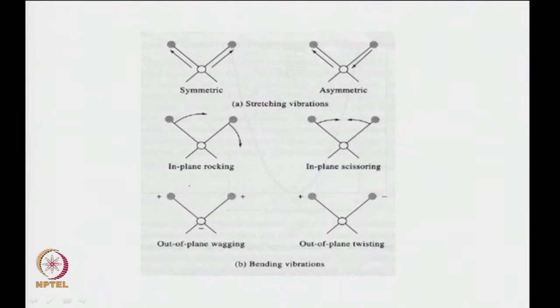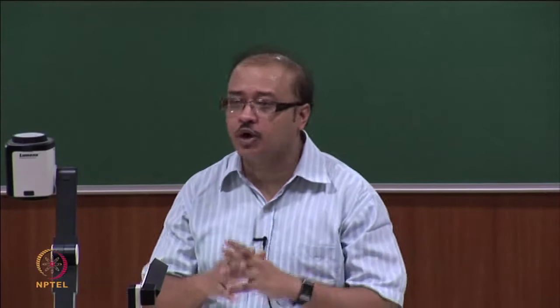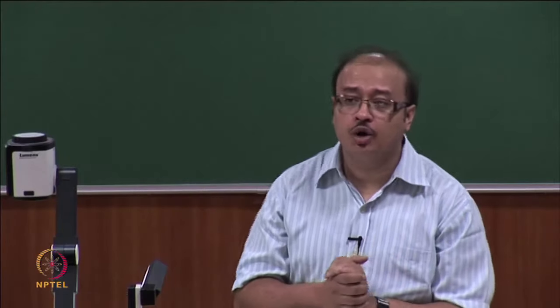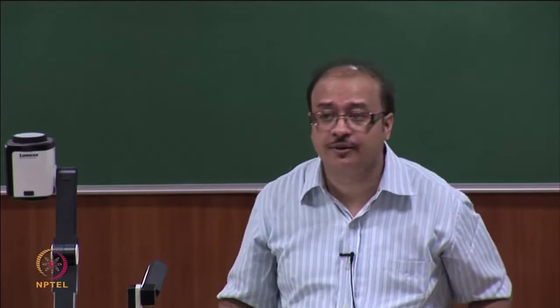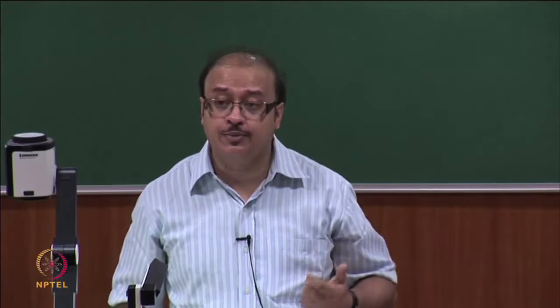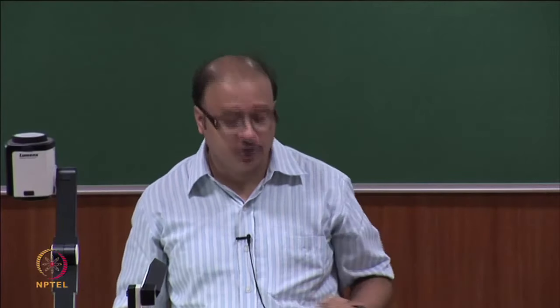Whenever we talk about vibration, these are broadly the different types of vibrations that can be present. Now, when we go to a protein molecule, all these types of vibrations would be there, but what are the types of vibrations we would be really interested in if we want to look at protein folding, unfolding or different conformational aspects? That is what we are going to focus on.